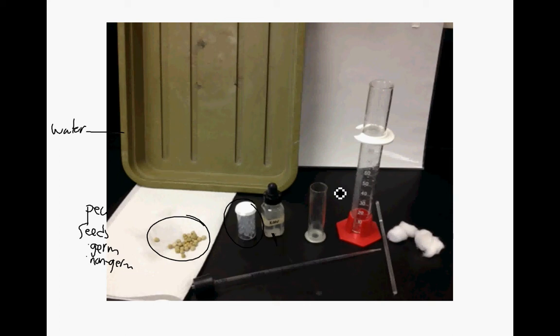Here is the chamber, circled in black. And then here is the graduated pipette. And here's a graduated cylinder that you're going to use, and this is a glass stirring rod. And then here we've got absorbent cotton and non-absorbent cotton. So these are all the materials we're going to use. Oh, and a thermometer. I didn't put a thermometer on there, but we want to know the temperature of that water bath.